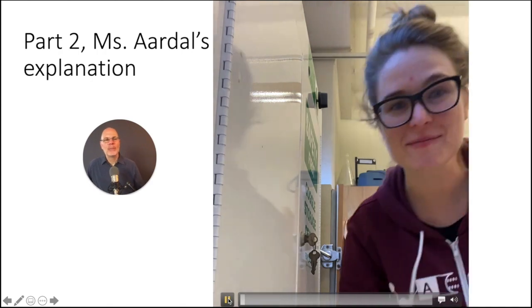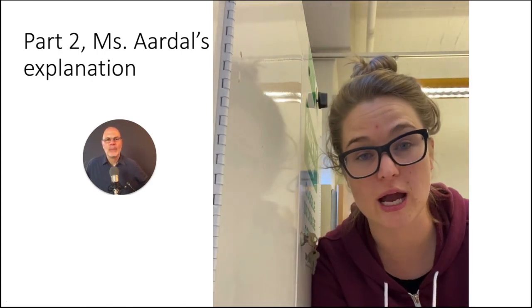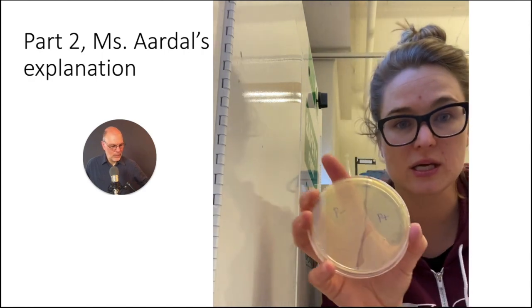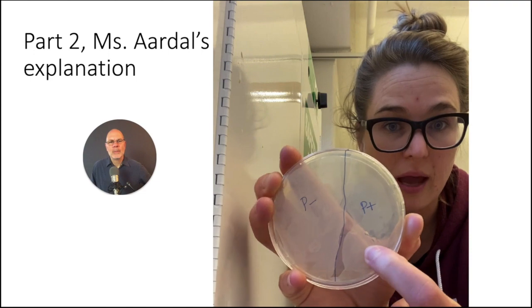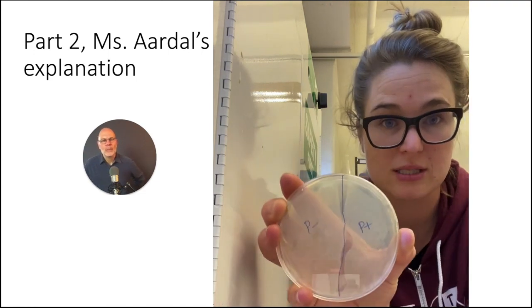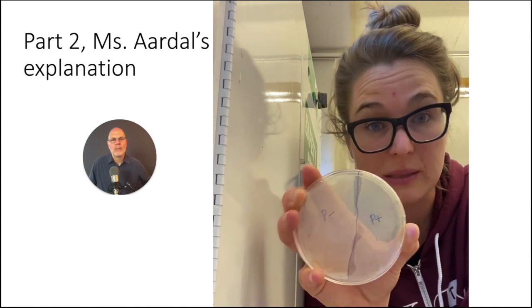All right, team, time to look at some results. So the first one that we're going to take a look at is our LB plate. On this plate, you can see that we had growth of both the plasmid bacteria and the non-plasmid bacteria. So on this plate, we had growth of both of them. This is the LB plate.